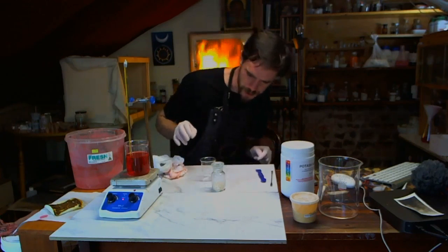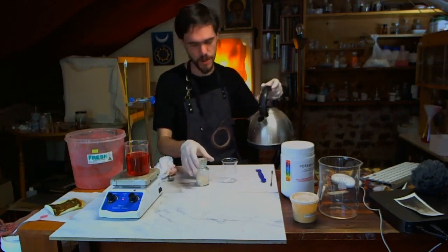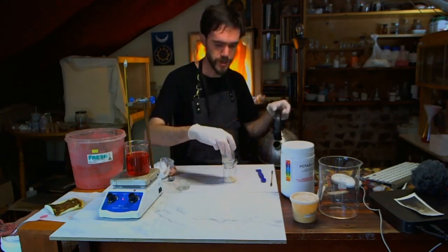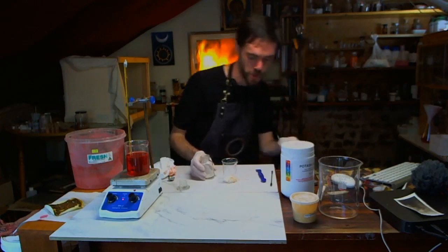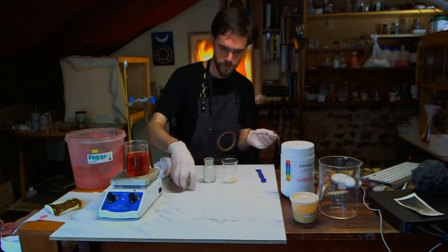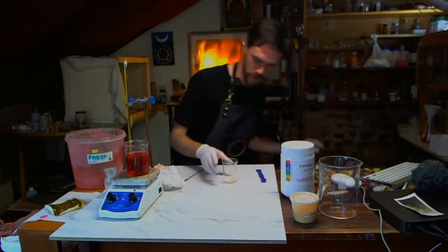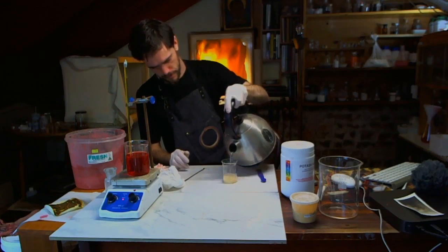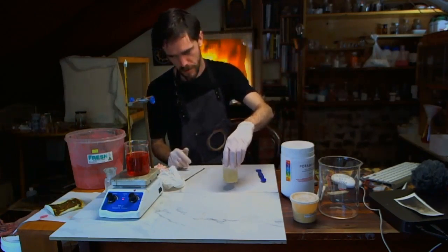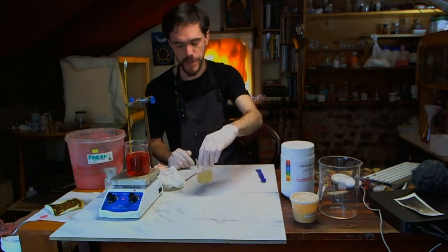So, we'll just make up a little solution of the lead acetate here. Again, this is a lead compound, so we should be quite careful with it. Although the Romans used to use this to sweeten their wine, because lead acetate is called sugar of lead. A bit of hot water. Super soluble. Lead acetate is very, very, very soluble.